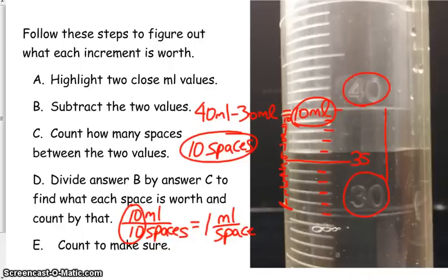So now we need to find our water level. So here is our water level right here. This is a plastic graduated cylinder, so there is no meniscus.